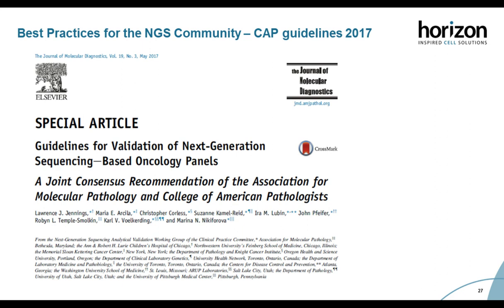Finally, I've included some screenshots of some of the best guidelines that are currently available for NGS labs. Here we can see an article that was published in 2017 called Guidelines for Validation of Next-Generation Sequencing-Based Oncology Panels. And this is some of the latest recommendations from the College of American Pathologists.